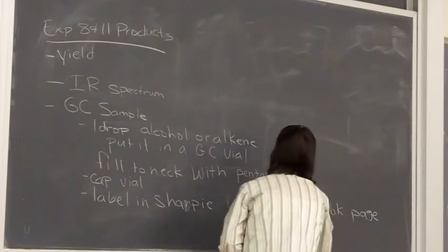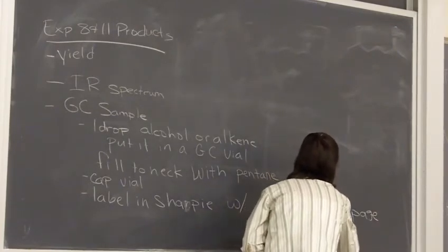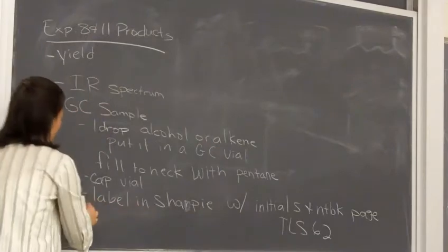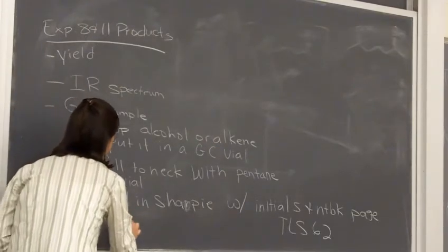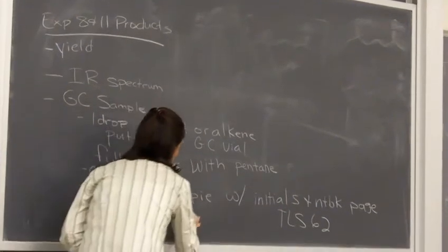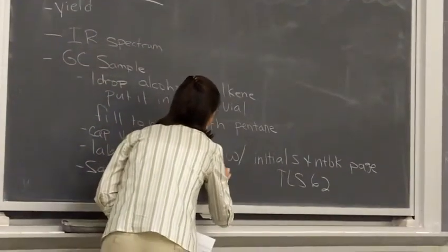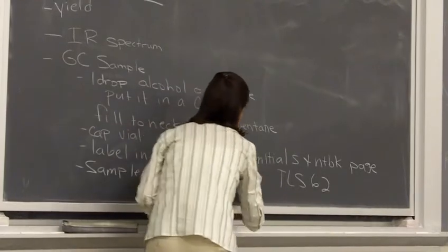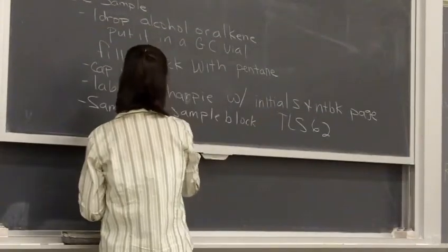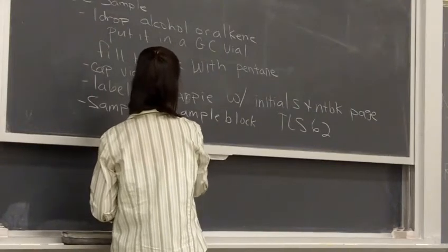So you know, something like that, okay? And then you're going to put the sample in the sample block. And then fill out this sample sheet too.